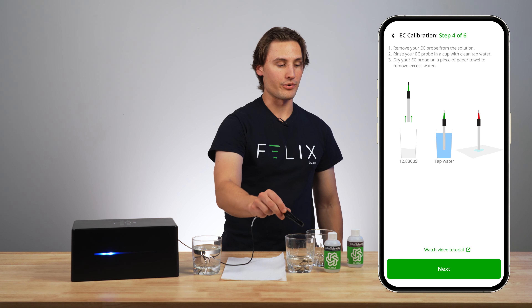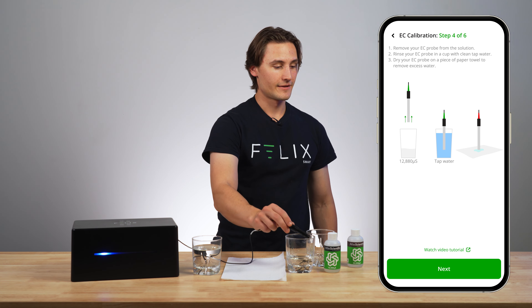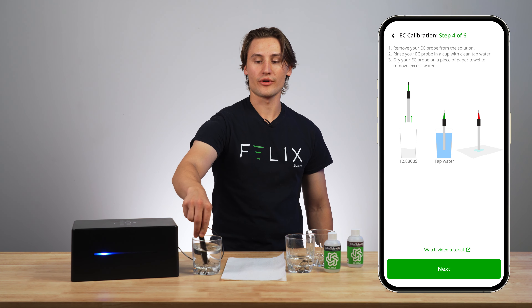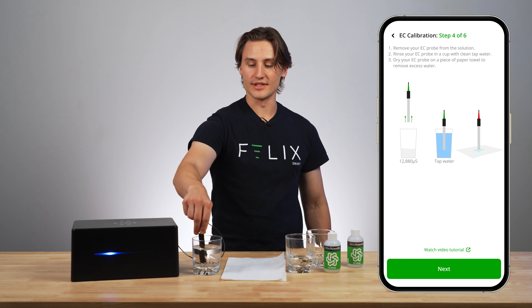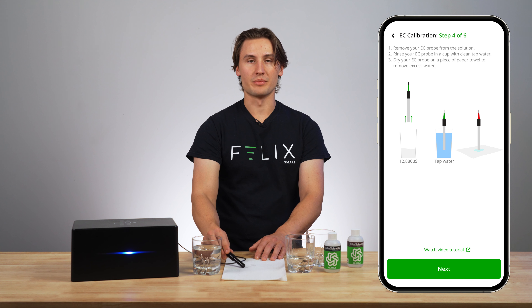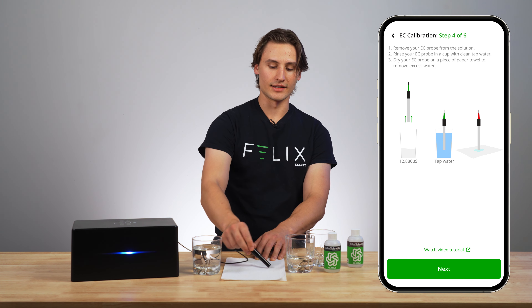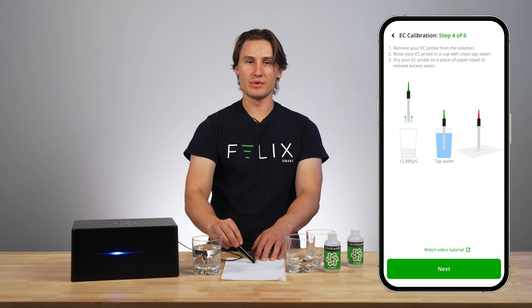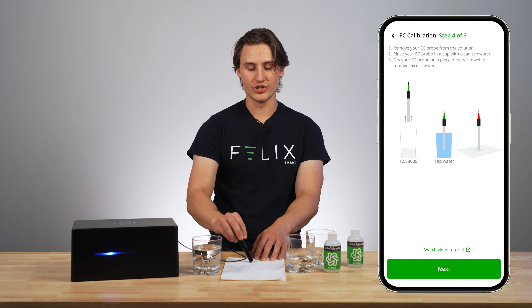Now I can remove my probe from the liquid. I'm going to rinse it in a cup of clean tap water — this is really important, rinse it really really well. And then I'm going to dry off any excess water on a piece of paper towel, just lightly tapping it. It's important that it is dry because this will affect your calibration solution.